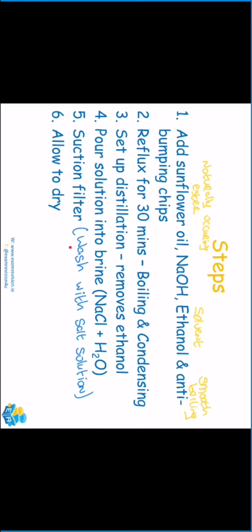It's important to mention here that during suction filtration, we wash our soap with salt solution, and it's salt mixed with ice cold water. And the reason we use a salt solution is it removes any excess sodium hydroxide that might be present, and the water that is used is cold to minimize the amount of soap that gets dissolved.